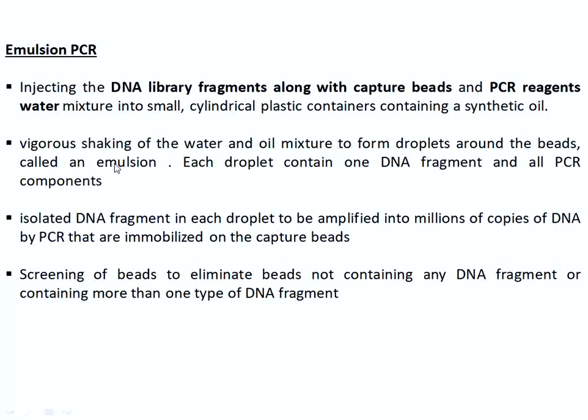So each DNA fragment captured on the bead is going to multiply into millions of copies.